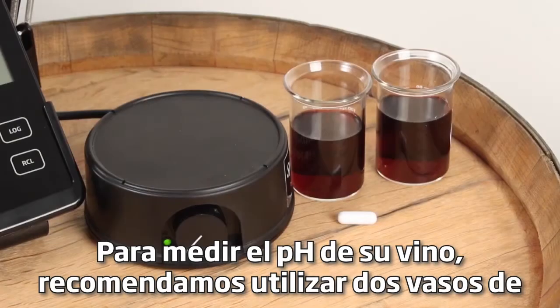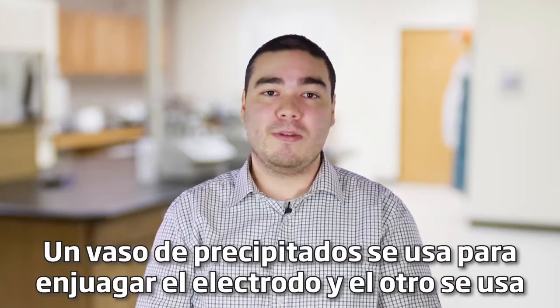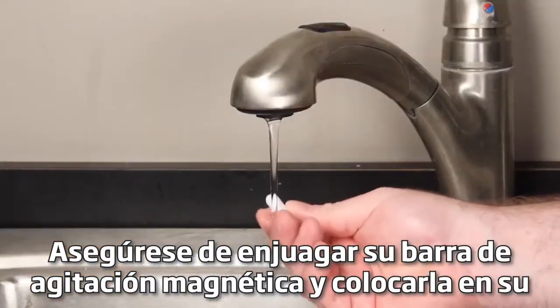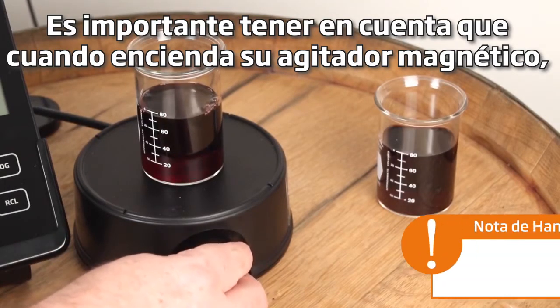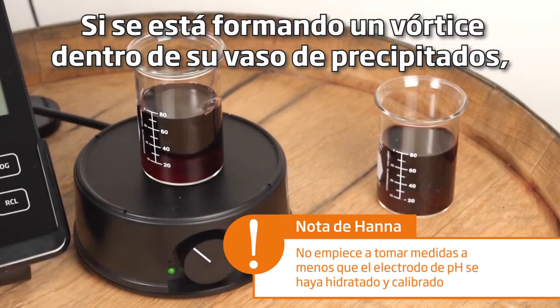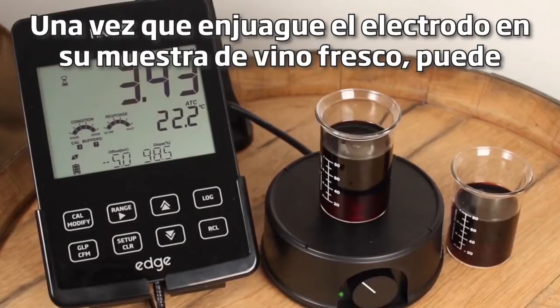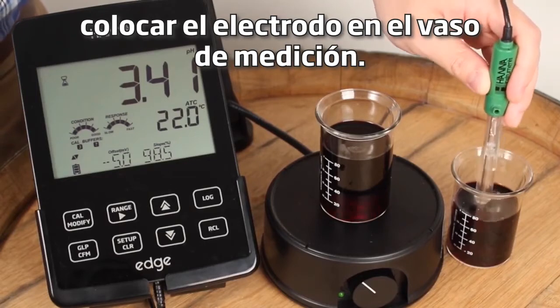To measure the pH of your wine we recommend using two beakers filled with enough wine to cover the pH electrode junction. One beaker is used to rinse the electrode and the other is used for your measurement. Be sure to rinse your magnetic stir bar and place it in your measurement beaker. It's important to note that when you turn on your magnetic stirrer you want the correct speed for best results. If there's a vortex forming inside your beaker it's moving too fast. Once you rinse the electrode in your fresh wine sample you can place the electrode in the measurement beaker.